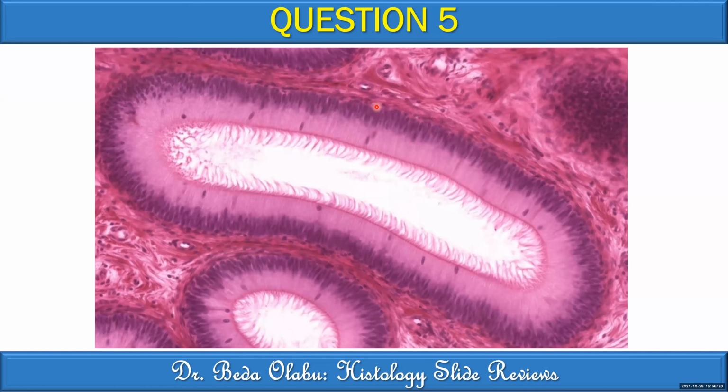Stereocilia is usually elongated and they tend to appear in groups. So we see some grouping, like that one is a group, that's another group. That is stereocilia, elongated, and they tend to be joining on top so that it looks like a pyramid for each group. That is stereocilia, very long.